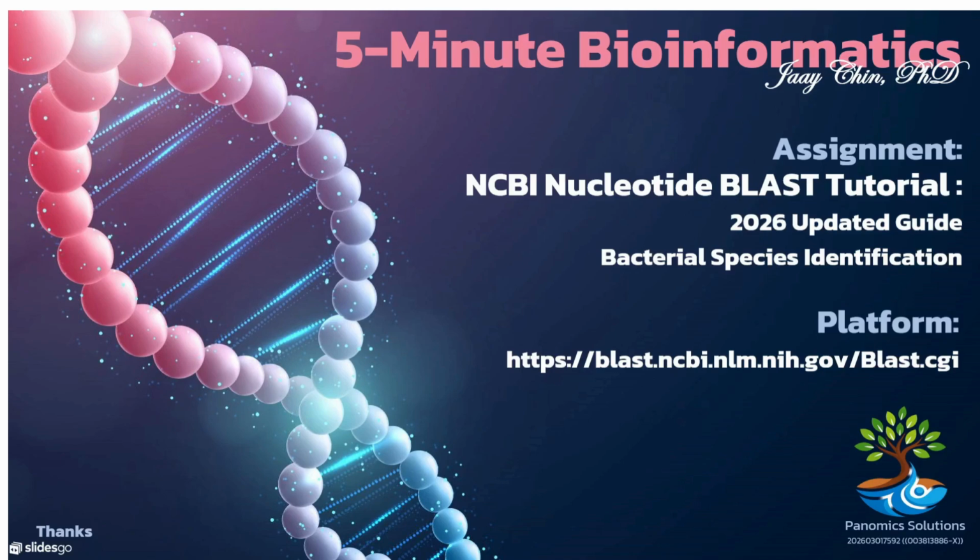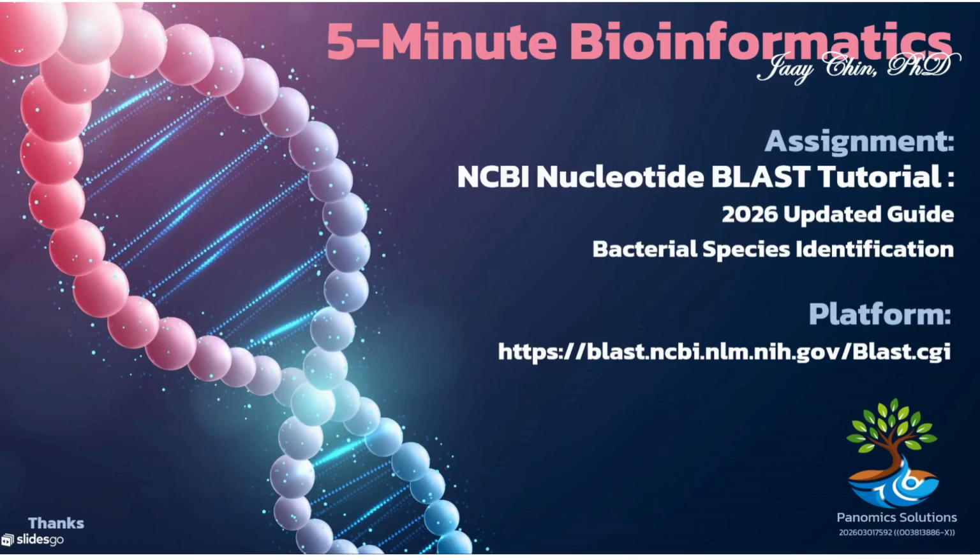Today, I'll show you how to quickly identify bacterial species using NCBI's Nucleotide BLAST, fully updated for 2026. Whether you're a student, a researcher, or just curious about microbiology, by the end of this video, you'll know how to go from a raw DNA sequence to a confident species ID in just a few minutes.